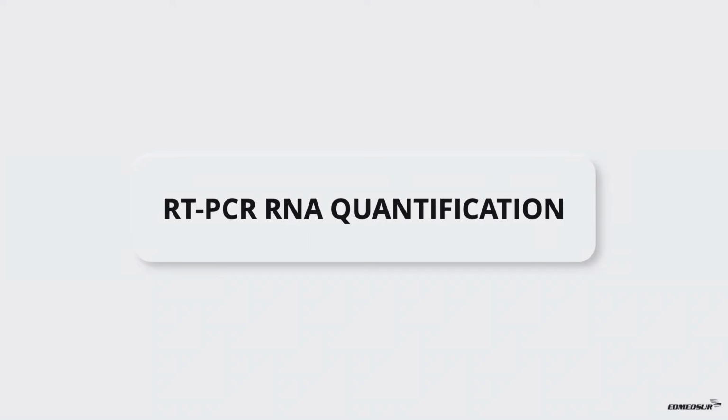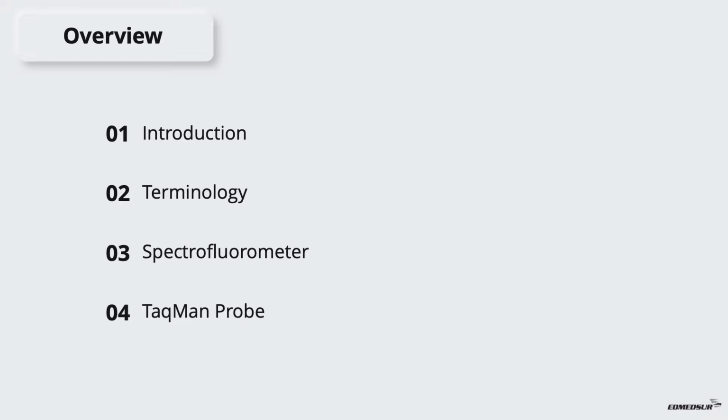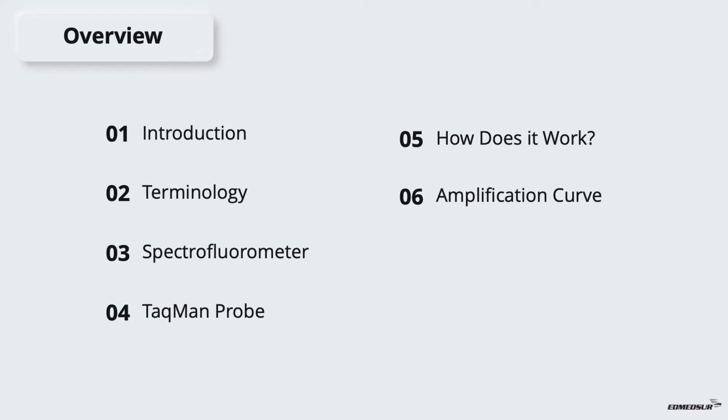RT-PCR RNA quantification. Overview. RT-PCR RNA quantification will be considered under the following headings: Introduction, Terminology, Spectrofluorometer, TaqMan Probe, How does it work, Amplification Curve, CT value, and Sample report.